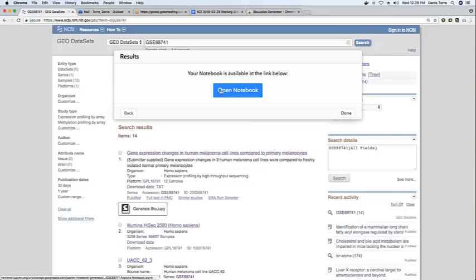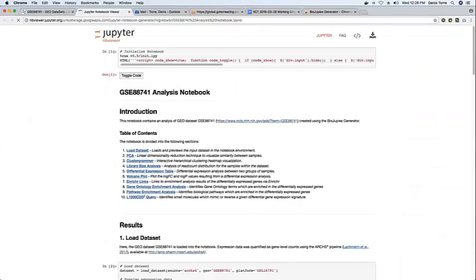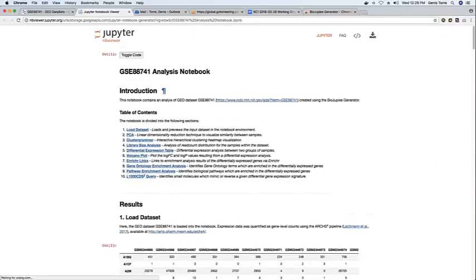So then by clicking on open, we are redirected to this public permanent URL hosted on the Google Cloud.